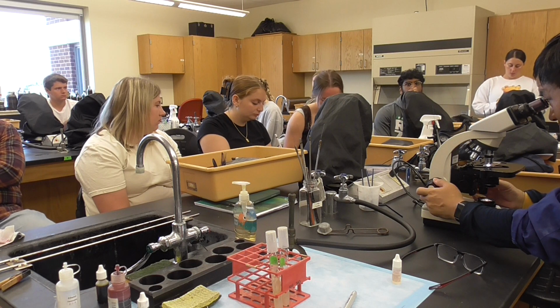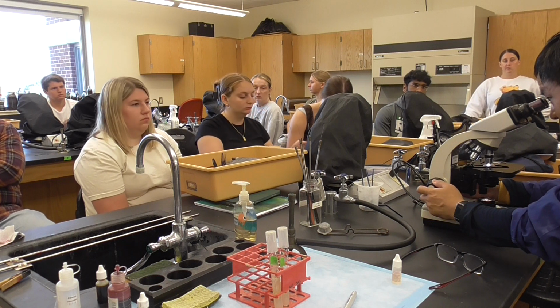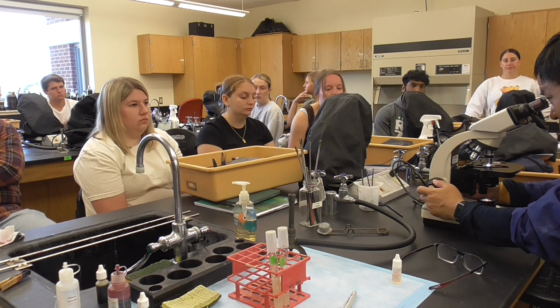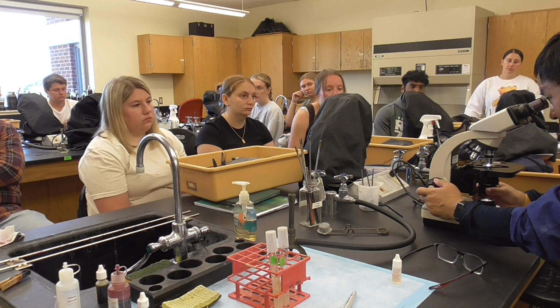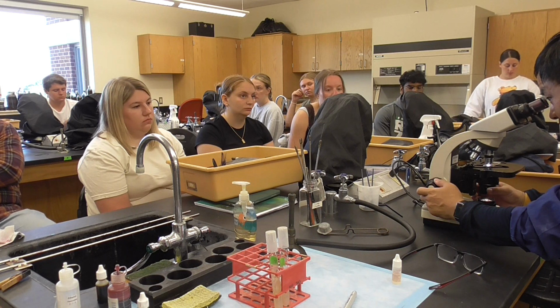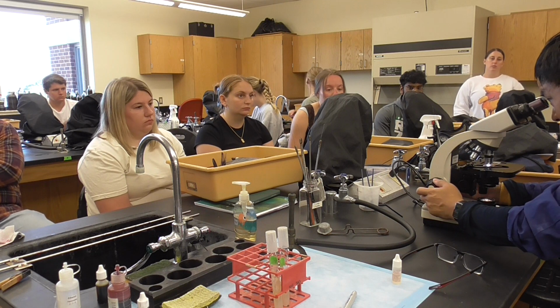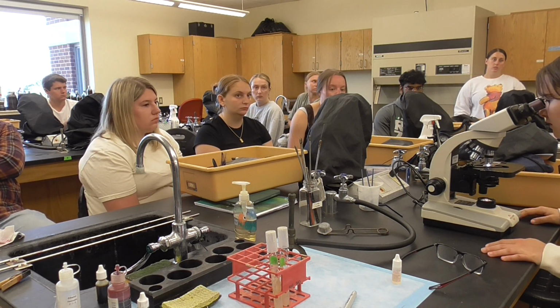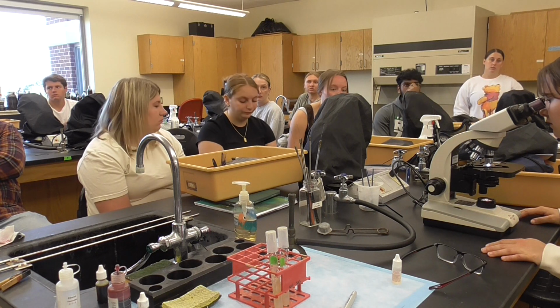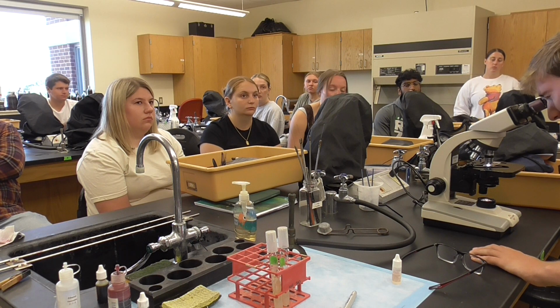And this lactobacillus, actually, you can see it's a lot of dots. So I believe this is lots of cocci. So this lactobacillus could be some cocci, but it's gram-positive. So go ahead and see it. You can see some of the cocci there. Is that right? You can see some cocci, it's gram-positive. Absolutely, it's gram-positive. It's purple color. So that may not be lactobacillus.